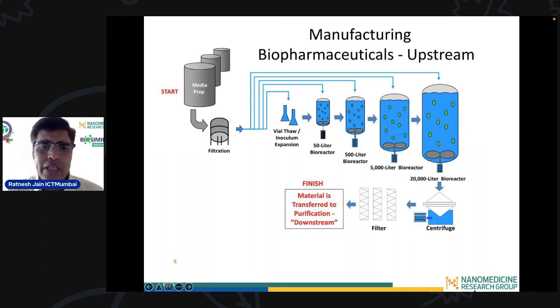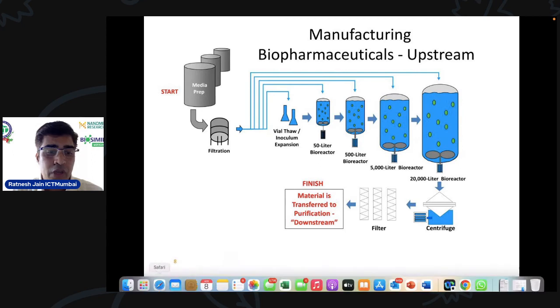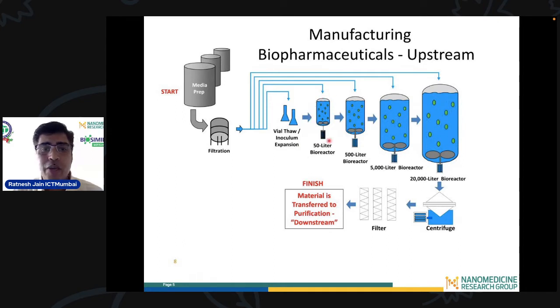It is also important to understand that when you are looking into bioreactor processes, these are what we call upstream bioprocessing. So this area where we are looking at upstream bioprocessing, I'm using my laser pointer, is extremely relevant to actually successfully launch your final material from a bioreactor. Once you understand what kind of bioreactor you are going to work on and what kind of upstream parameters you have decided, and if this understanding develops, largely you could reach a very large bioreactor level and go to a fill finish downstream level very effectively.